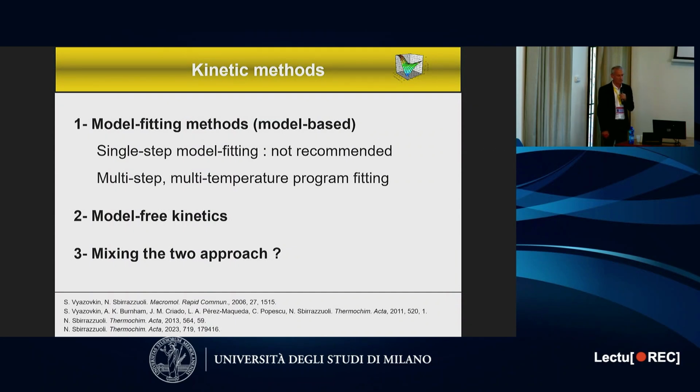To summarize, for kinetic analysis we have two kinds of methods. The first one is model fitting, or model-based. Nowadays, we do not recommend single-step model fitting. I will not go into detail, but I am in the ICTAC Kinetic Committee, so we published some recommendations not to use simple methods that were used in the past.